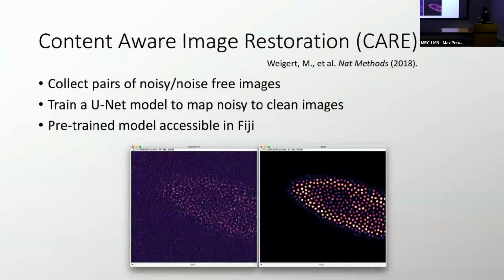This is called Noise2Void, where you assume that removing the information from the center pixel in a neighborhood, and trying to recover it by training a network, will enable it to learn a denoising function.